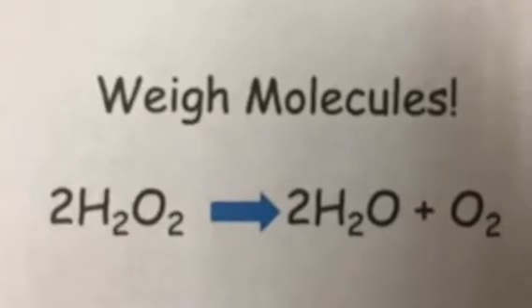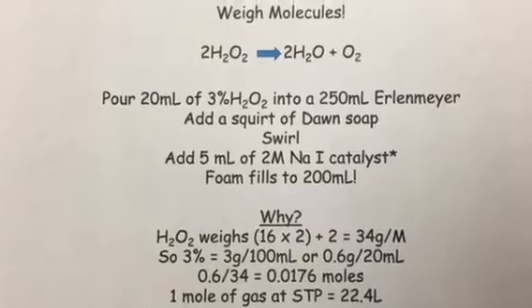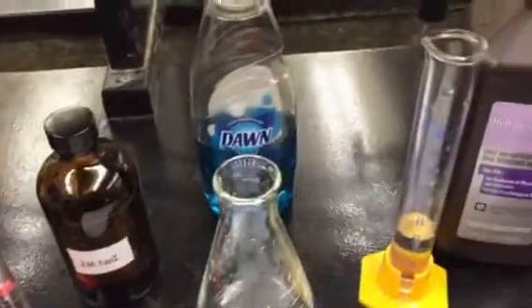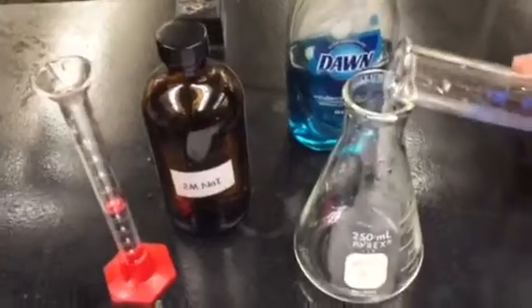I'd like to show you a lab that I was able to get to operate today fairly easily, and it relates the volume of oxygen gas formed to what the molecular weight of oxygen is. And the materials used are fairly simple and straightforward.